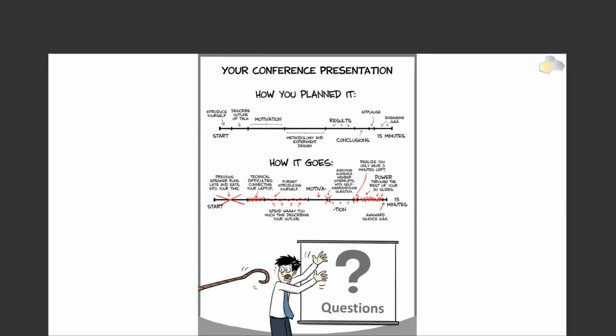The work on coronavirus is something that I recently discovered myself, that there are some people working on DVGs with coronavirus. It's something that we can look into. We have a lot of sequences from NCBI in HIVE. We maintain a version of NCBI's database for SARS-CoV-2 sequences, and we could be looking into these data sets, but these are not NGS reads.